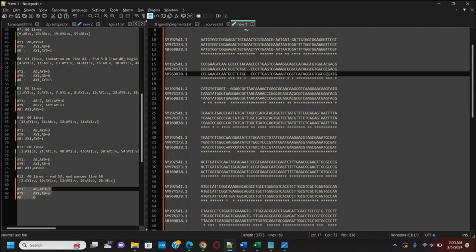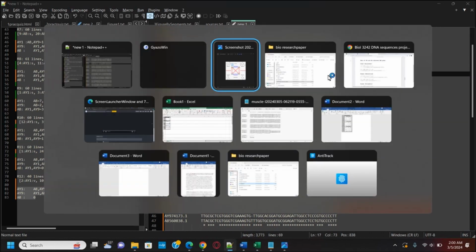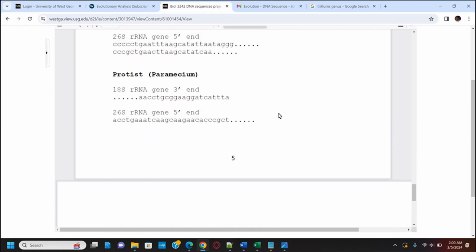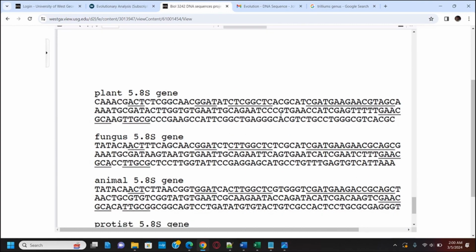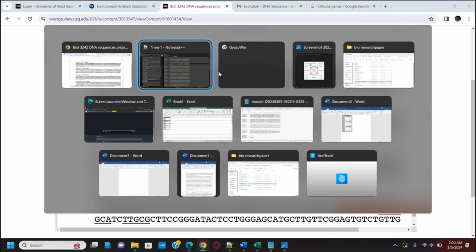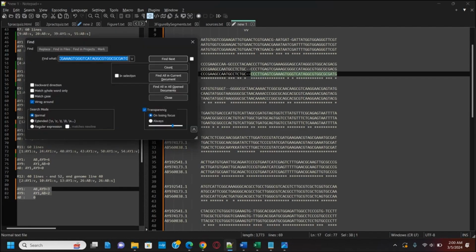Now I remember. So you'll have to come back to the document again once you get it all formatted and ready. Since I'm using a plant, I would go to where the underlines are, and Notepad can do this too. But mine, I remember, starts at 6.